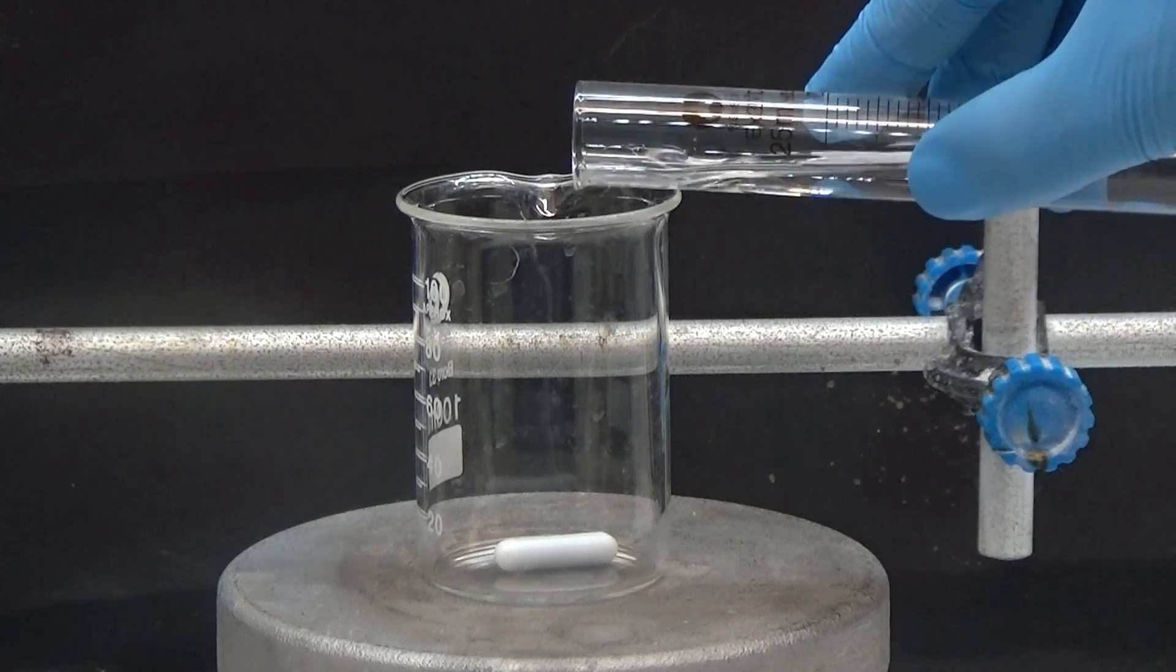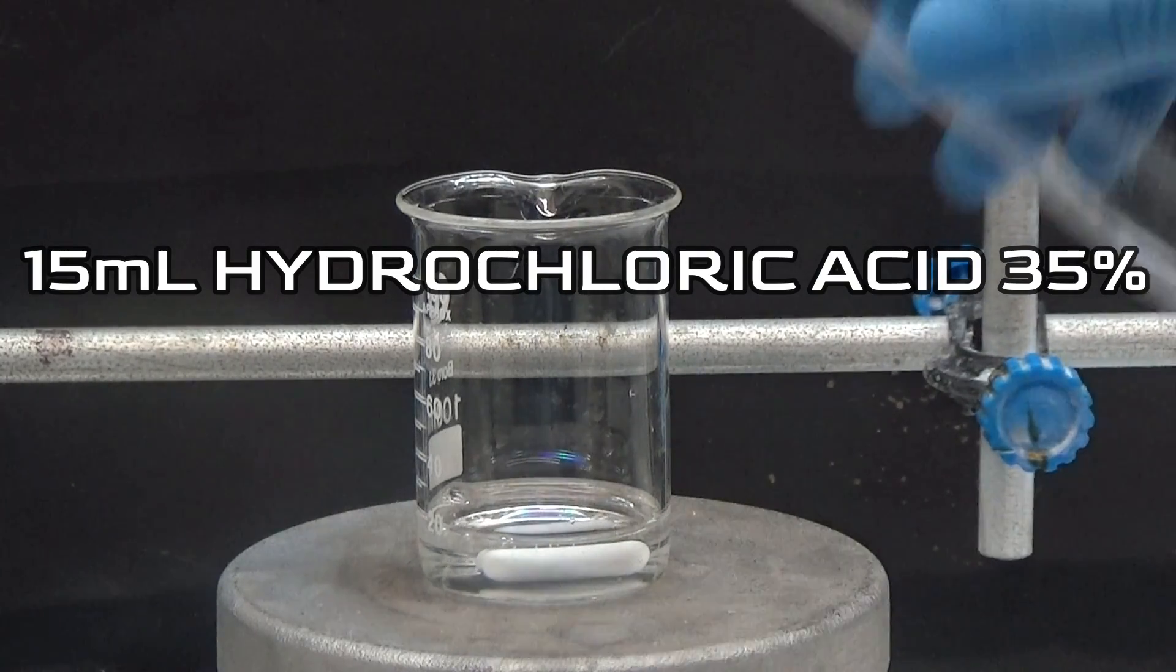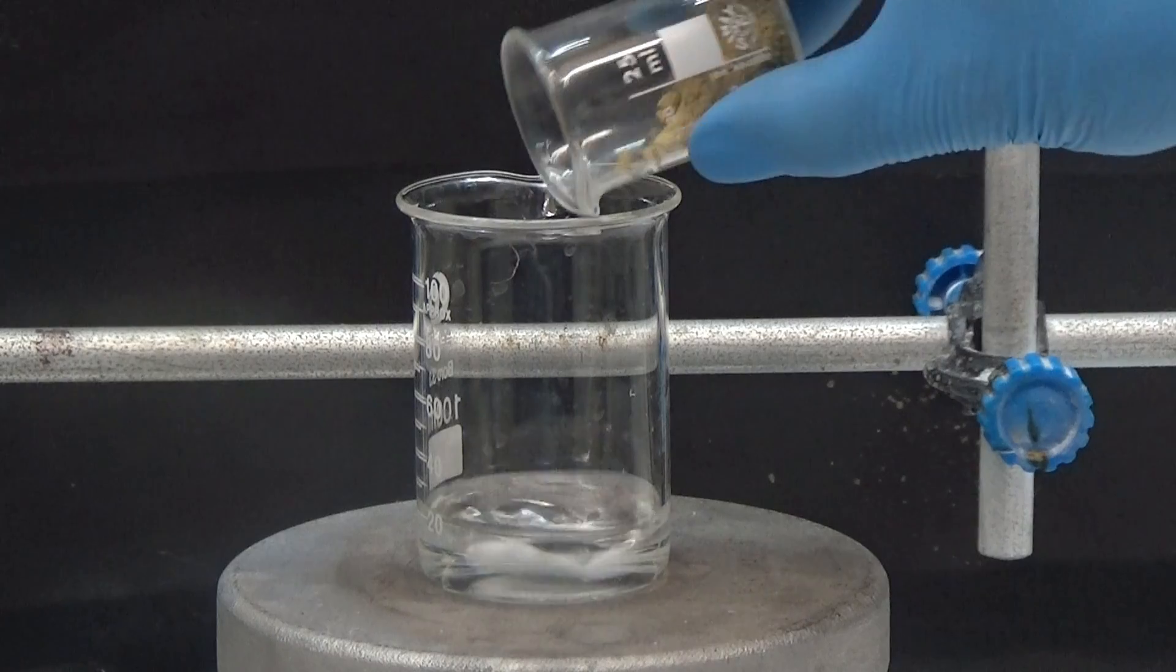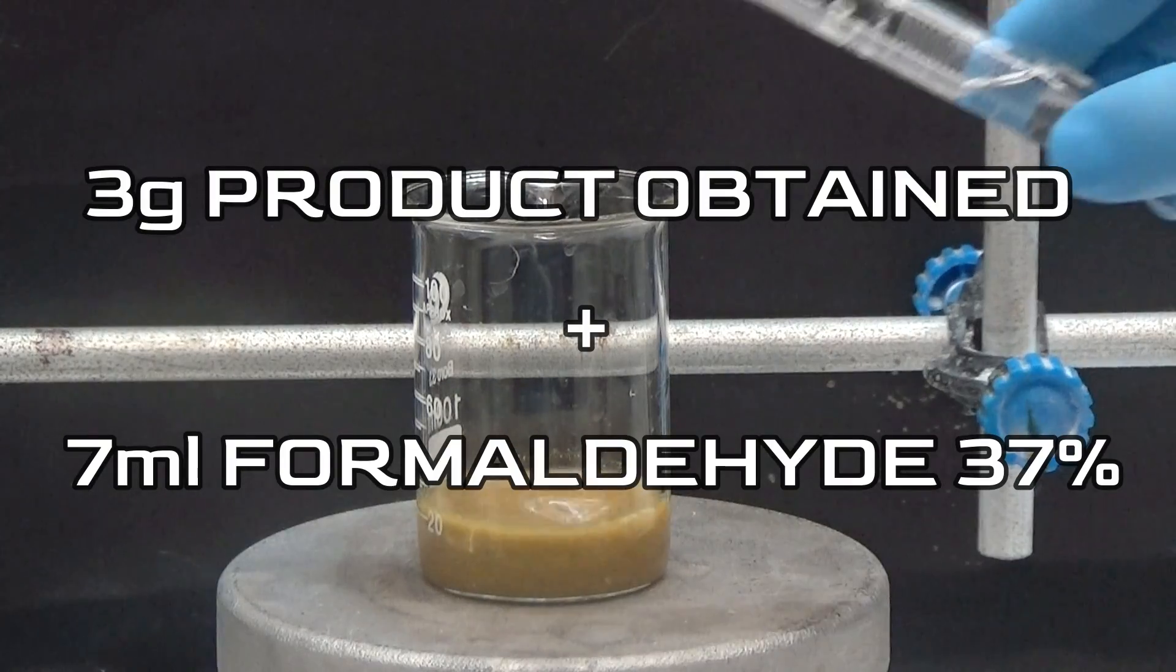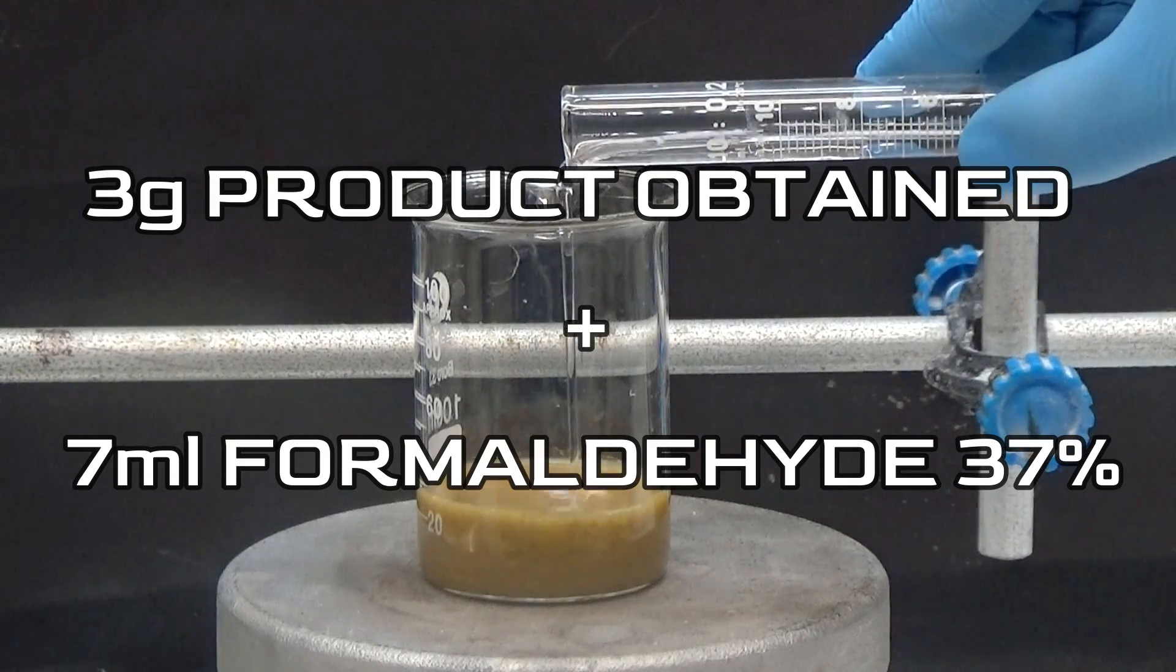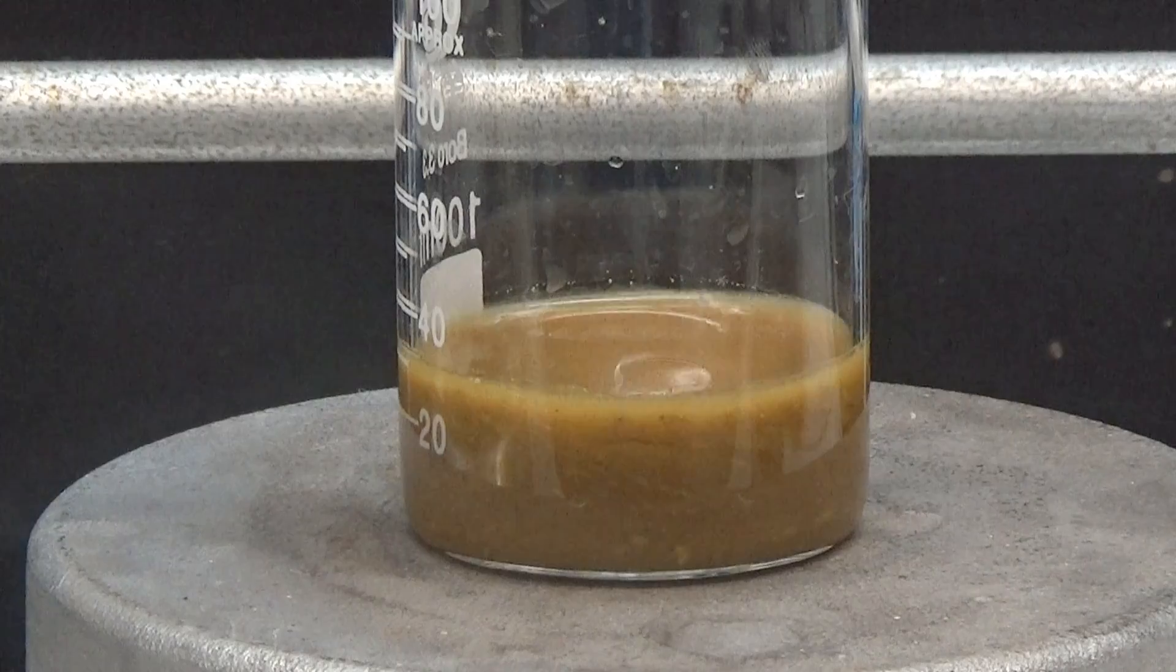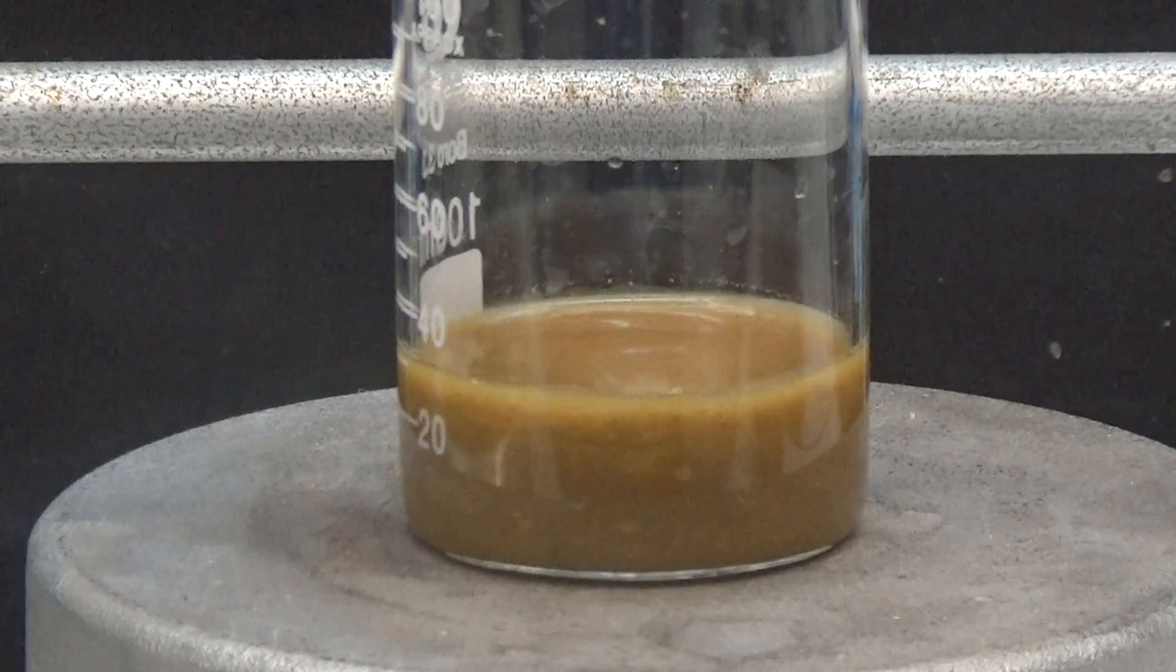In the second part of the synthesis, we added 15 ml of 35% hydrochloric acid to a 100 ml beaker. With stirring, we add 3 grams of the product obtained previously and 7 ml of a 37% formaldehyde solution. Stirring for 3 hours at 25 degrees.